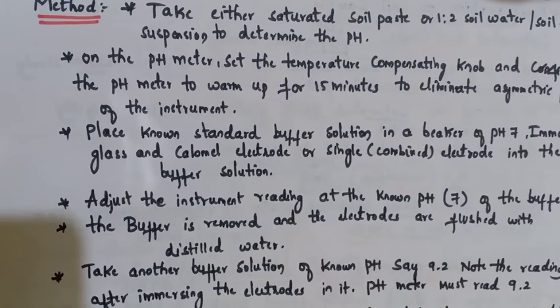We have to learn the overall method to determine the pH of a soil sample. Now we have prepared the buffer solution and we have prepared soil samples also. Then let us see the method.